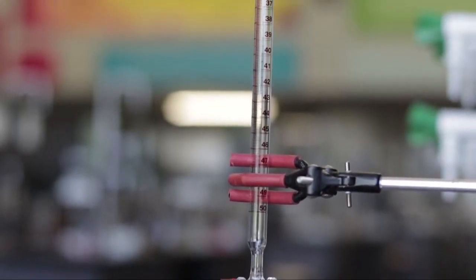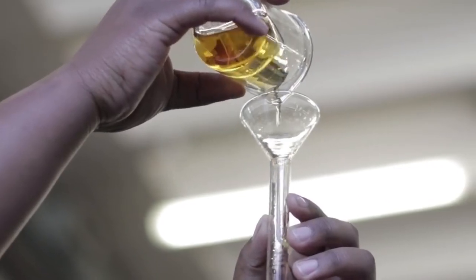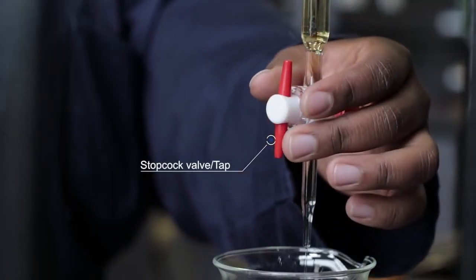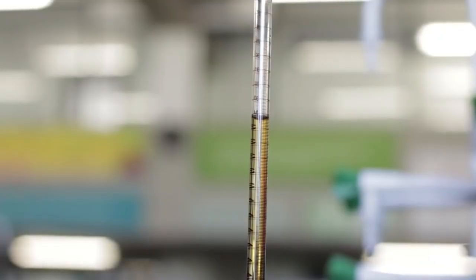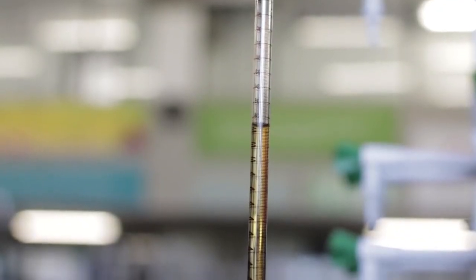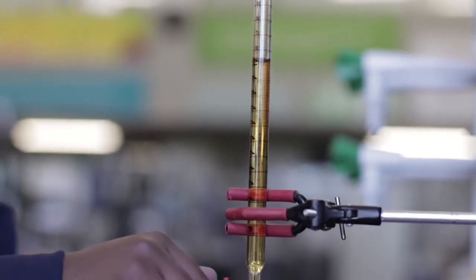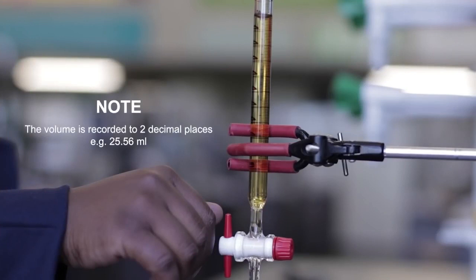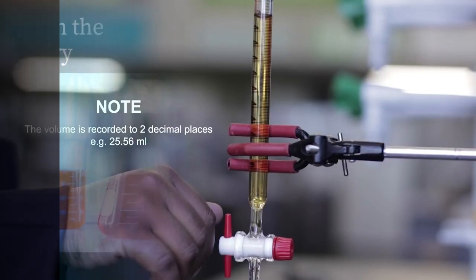A volumetric burette delivers a measured volume of solution. The flow of the liquid is controlled by the stopcock valve. Burettes are available in different sizes. A burette is usually used during a titration. The volume is recorded to two decimal places, for example, 25.56 milliliters.